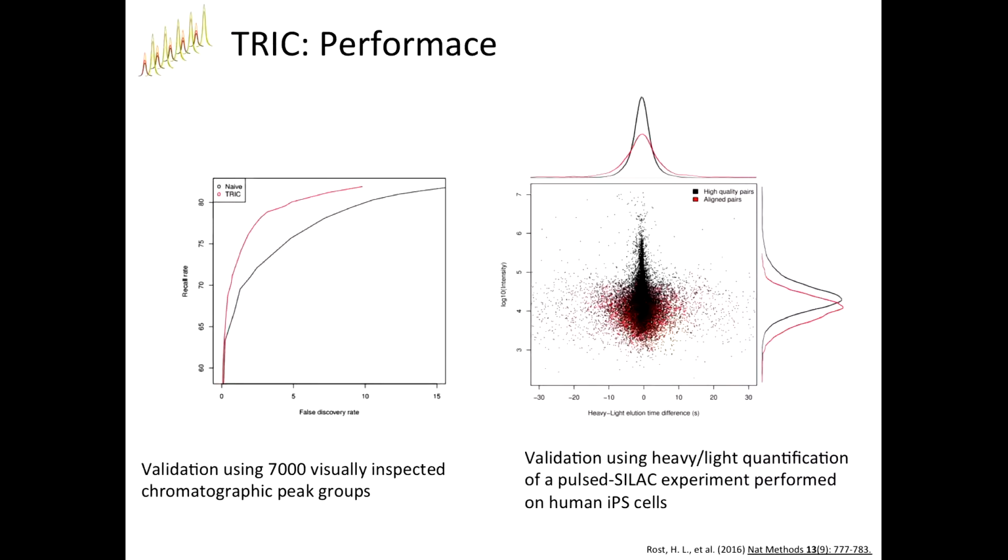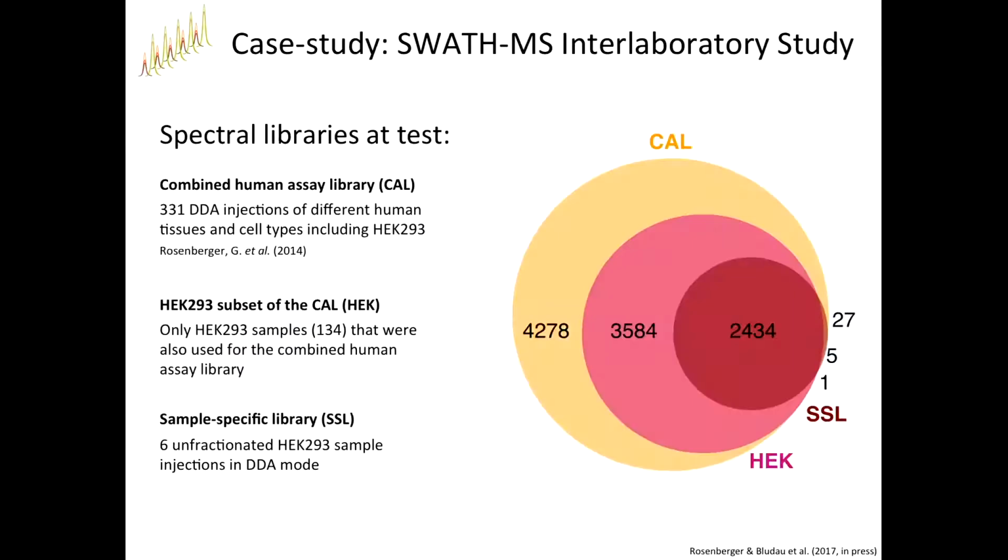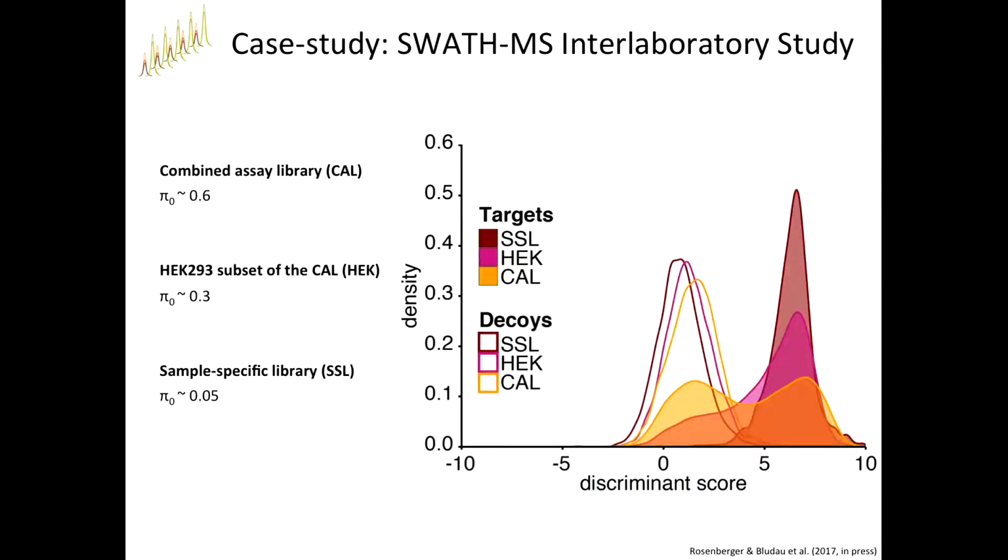And the point where you have to be careful is, let's quickly go back, as soon as you see that your distribution looks more like the yellow one and not like the red or pink one, then you should consider doing a protein level FDR control, and when you want to assess large data sets, that you control for error accumulation across this data set. So I think that it's quite important to assess these discriminant score distributions. The things you should look for is, first of all, the distribution of the targets to these two distributions.